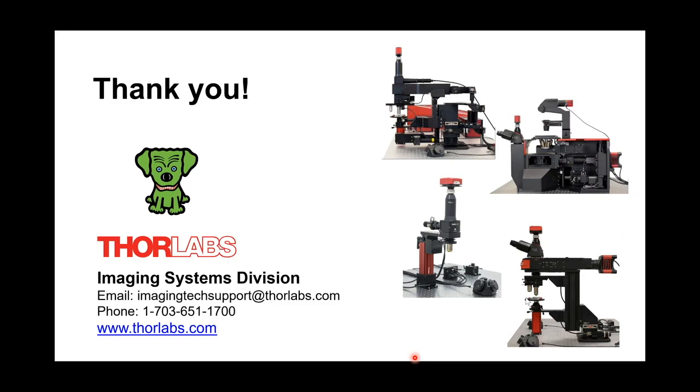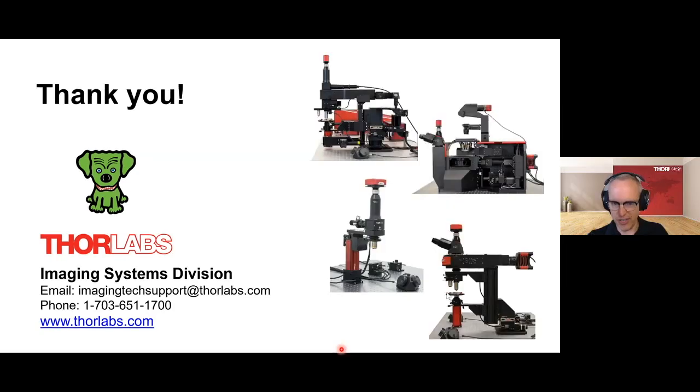Excellent. That is a great question. Ideally, you are going to customize for multiphoton or confocal. Your excitation optics can be the same, although you are frequently using different wavelengths of lasers. So your optics would have to be broadband to handle the shorter wavelengths for confocal and the infrared wavelengths in multiphoton imaging.